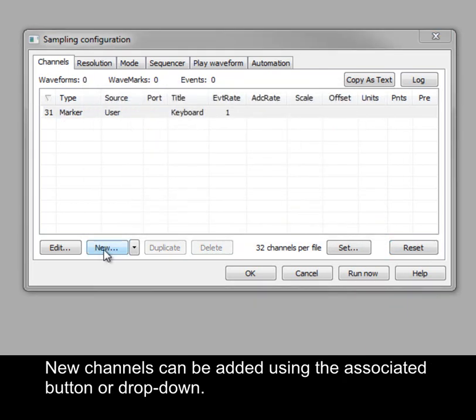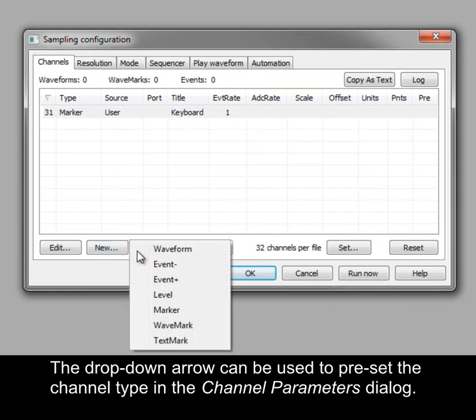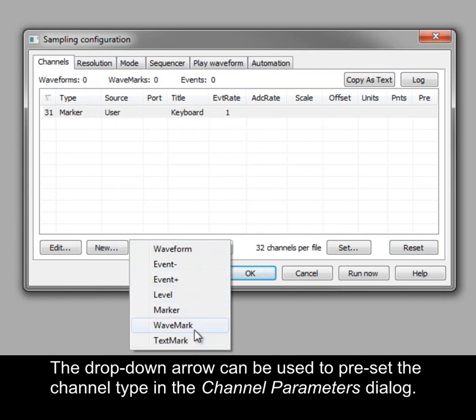New channels can be added using the associated button or drop-down. The drop-down arrow can be used to preset the channel type in the channel parameters dialog.